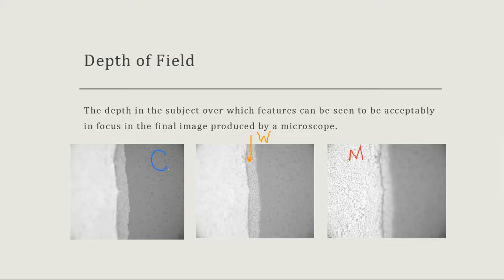Since they're three different hardnesses, they will wear away at different rates. So when you go to look at your depth of field, one will be more in relief than another. Okay, so that's why metallographic preparation, a proper way, is important in this case.